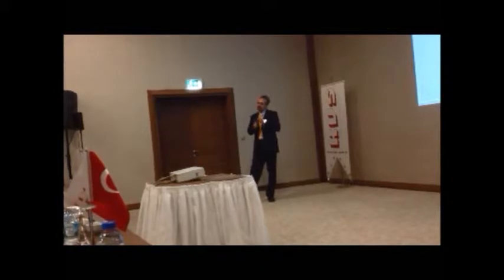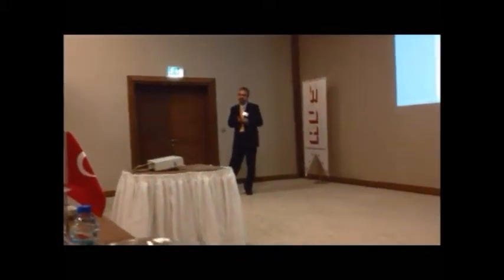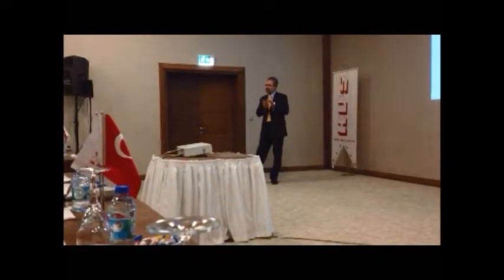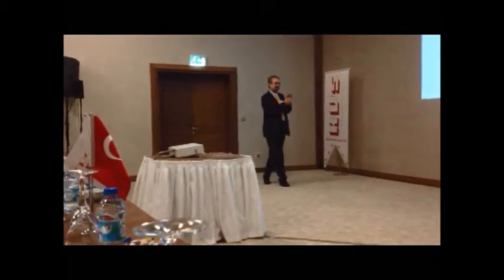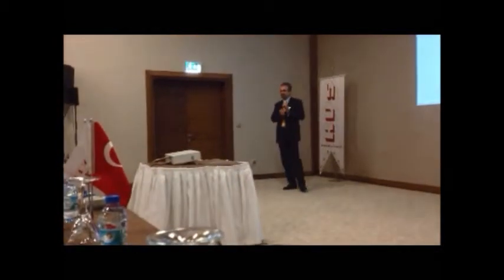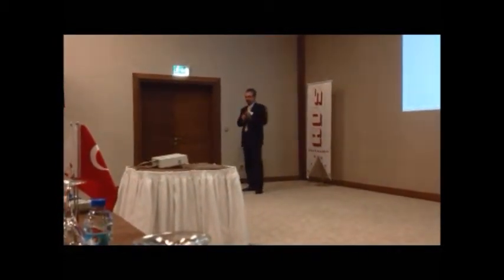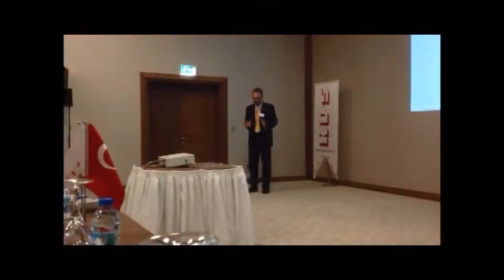You make a qualification of an equipment, but you perform a validation of a process and a calibration of an instrument. And I can go on. Validation means how you use the autoclave and should be integrated in your production process.